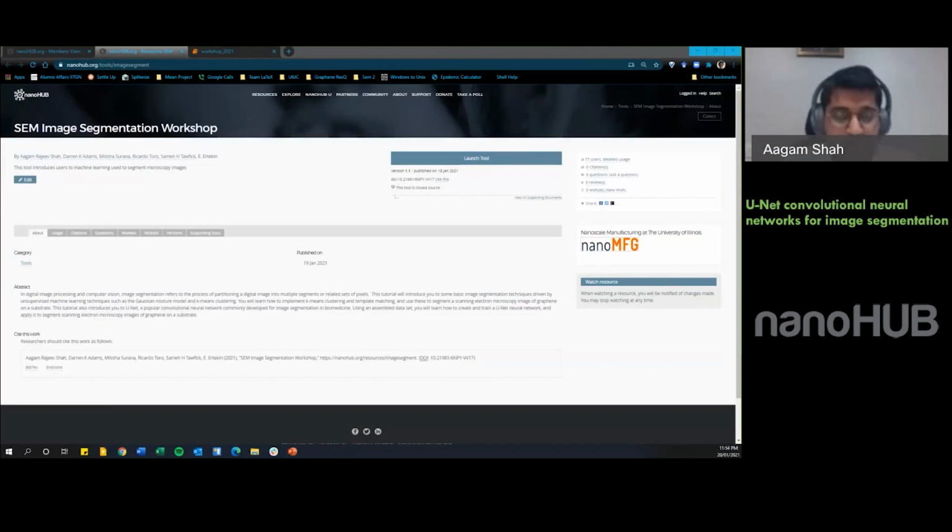Is that a binary mask? Yes. So we eventually apply a binary filter to it and we get zeros and ones. Initially what we get is not just a binary mask. So initially we get a range of values, but we apply a binary filter to generate a mask.